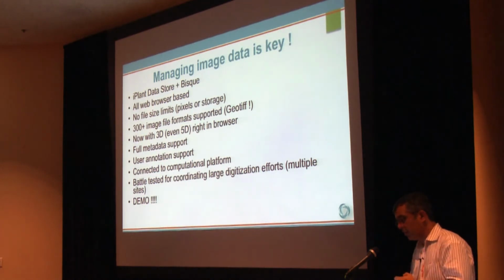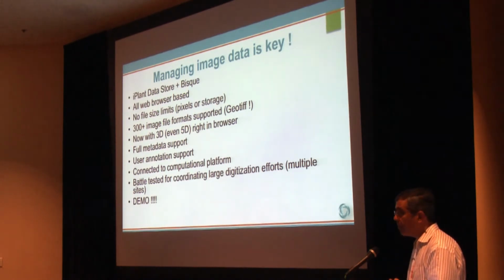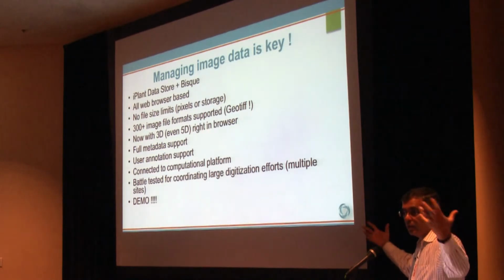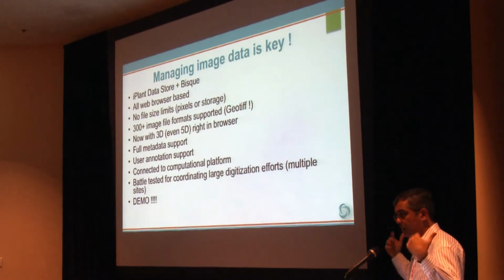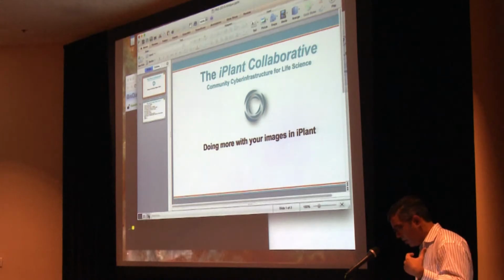And finally, this is battle tested. We have groups that are doing this. There are quite a few NSF-funded digitization efforts. They all use this. They are distributed across the country. They're streaming data that comes into the data store, and then they go look at their images and do a lot of the analysis inside of Bisque. And so with that, I'm going to jump into a demo.